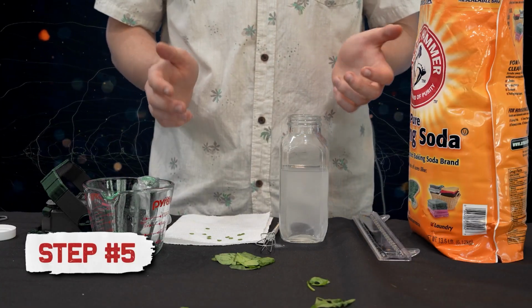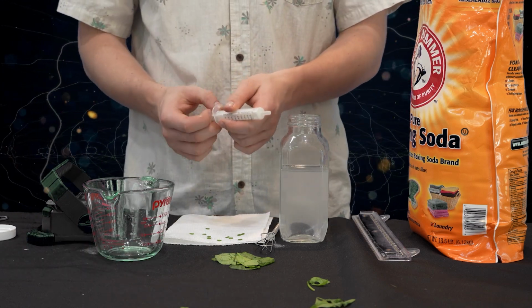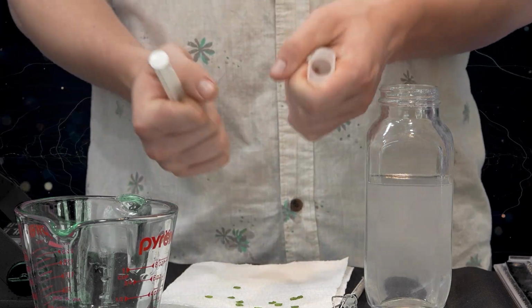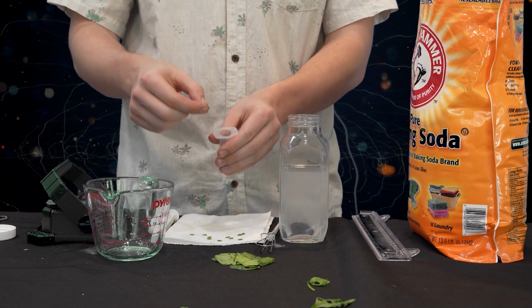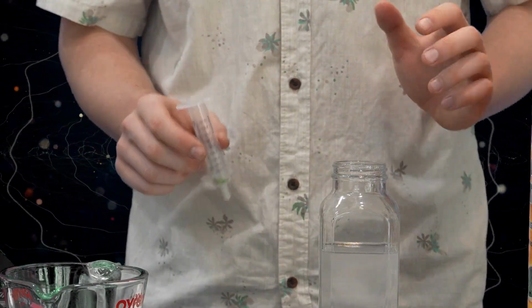Okay, now step 5. This is going to be pretty much the hardest part of the experiment. So what you're going to want to do is take your syringe and open it up so there is nothing inside of it. Then we are going to take our little spinach discs and put them inside of the syringe. Okay, that wasn't actually the hardest part of it, but we're getting to the hardest part.